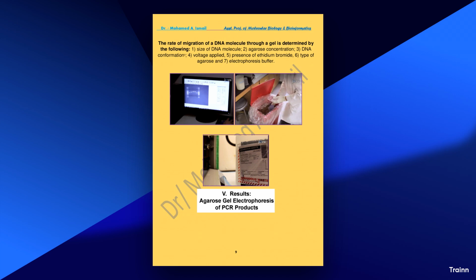4. Nonspecific amplification. Description: nonspecific amplification occurs when primers bind to unintended sites, resulting in additional bands on the gel. Identification. Appearance: multiple bands at sizes different from the target product. Impact: this can complicate interpretation and reduce the specificity of the assay. Causes.